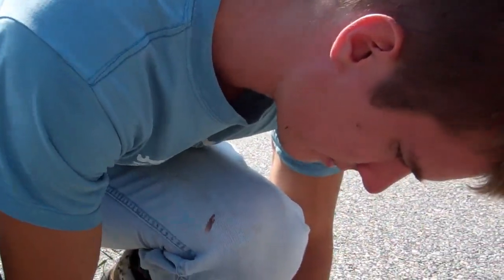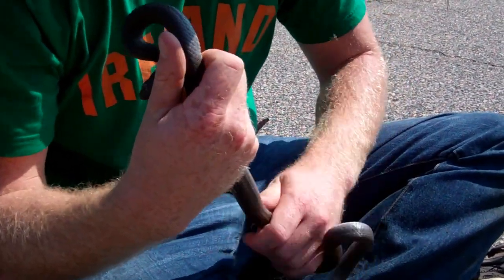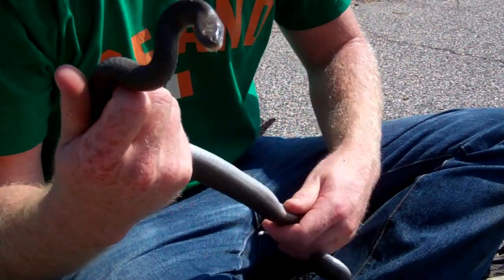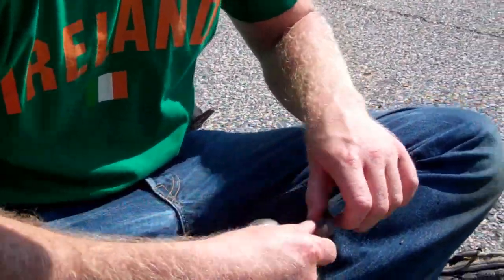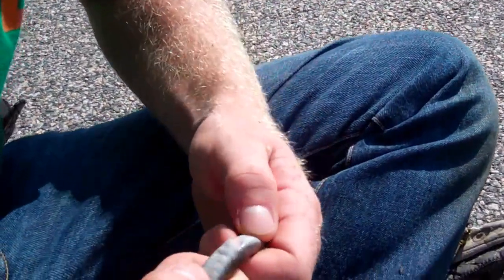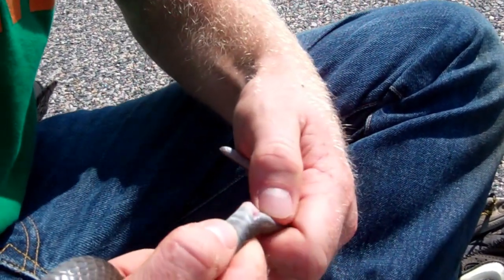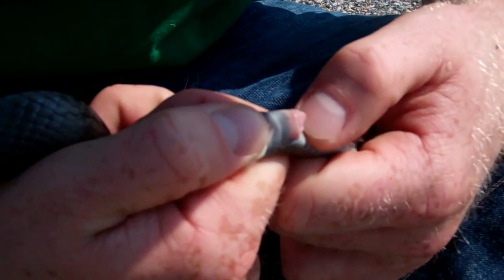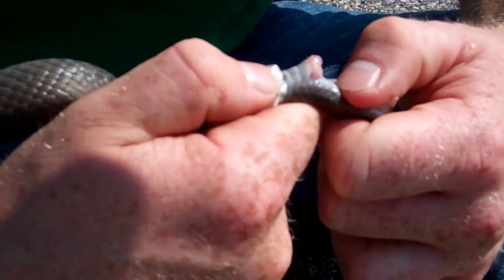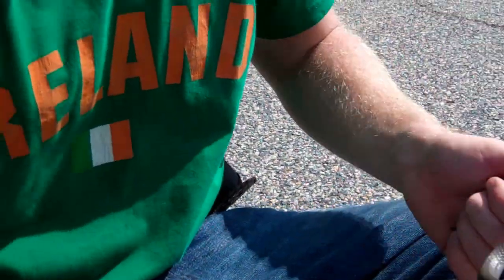Then we check for if it has a recent meal — kind of feel along its body. I don't feel anything recent. We try to sex it and see if we can determine what it is. It is shedding — make sure you note that down. Looks like it's a female.